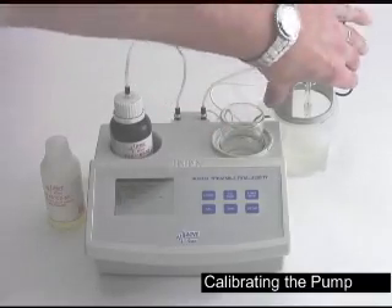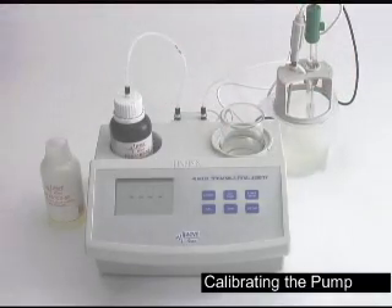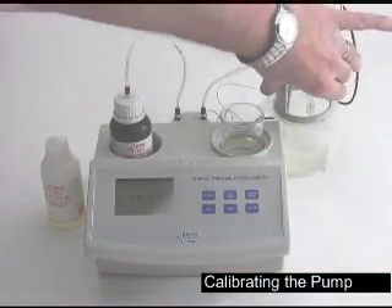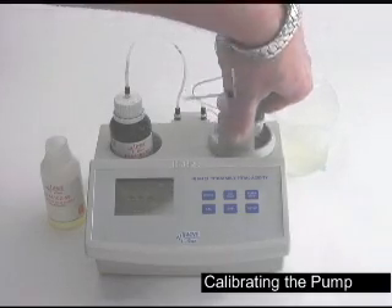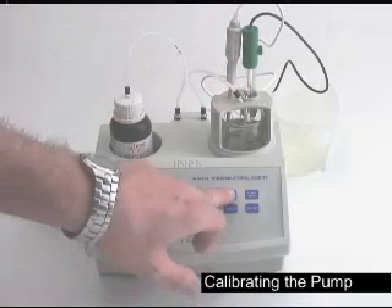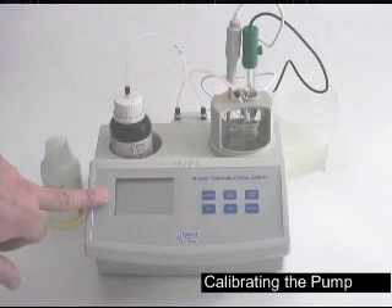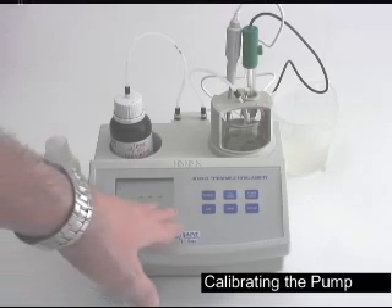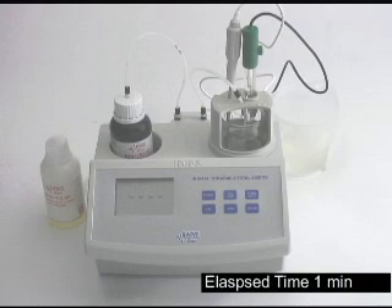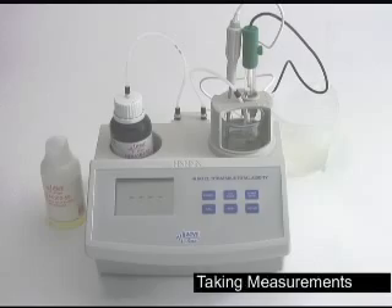Place the beaker into the titrator. Rinse your probes and place them back on the titrator. Make sure your tubing is down into the solution. Press your cal pump button. The standard will blink across the screen and then start. Once the calibration is completed, it will flash done across the screen and then go back to the same four marks again. Now the pump is calibrated and the probe is calibrated — we're ready to start testing.